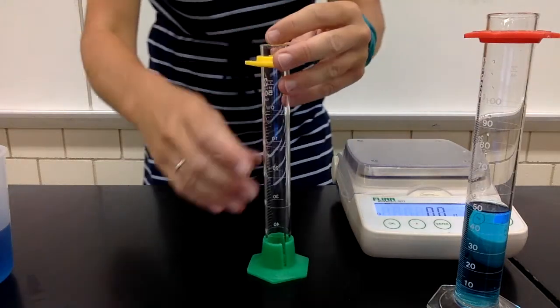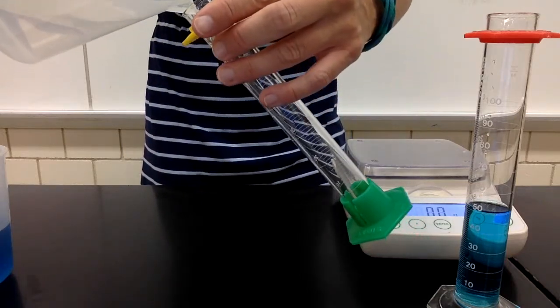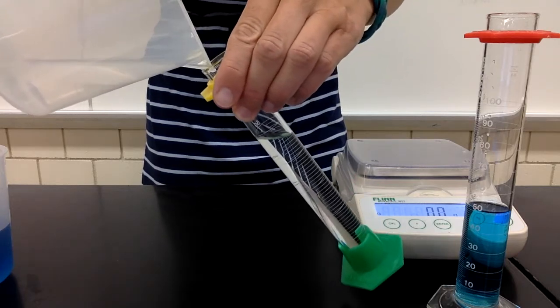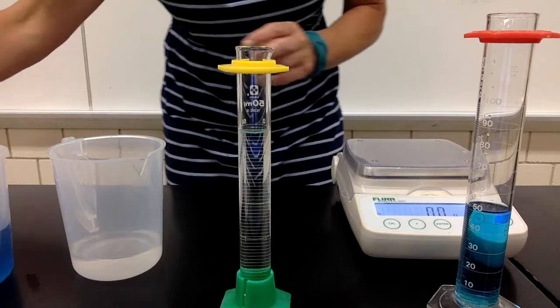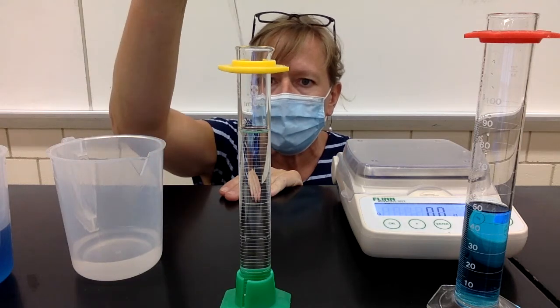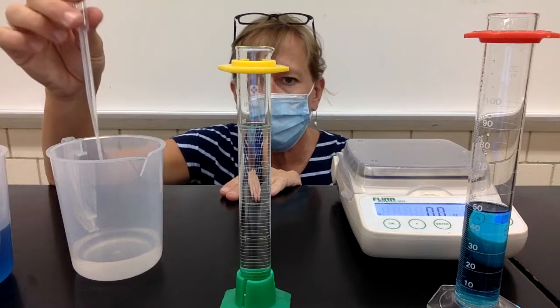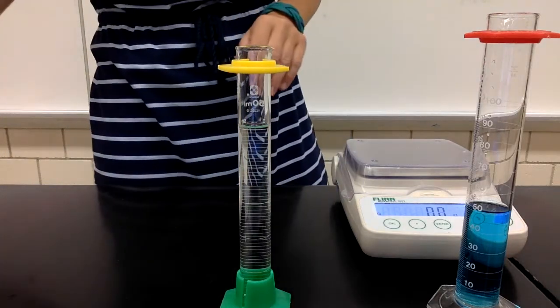The next thing I'm going to do is measure out my 50 milliliters of ethanol. Again, carefully pouring at a 45-degree angle so I don't splash and make a mess. And then I'm very close to the 50 mark, so I'm going to grab my pipette. It's definitely below 50 when I look at eye level, so I'm going to add some more. There we go. Now my ethanol meniscus looks like it is right about at the 50 milliliter line, so I am ready to add the ethanol to the water.